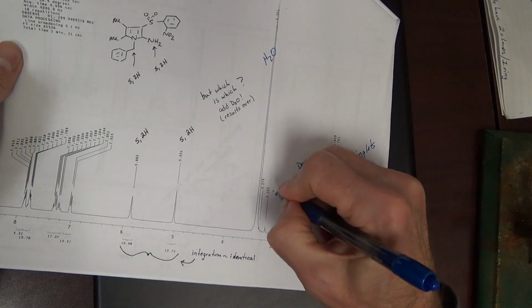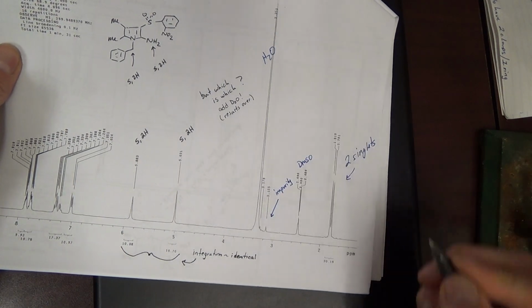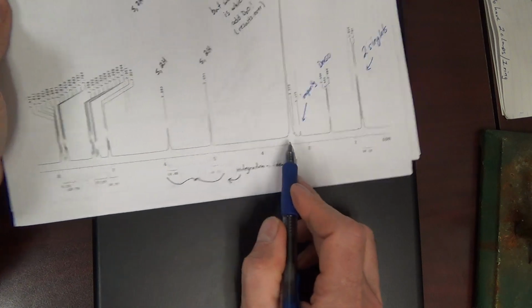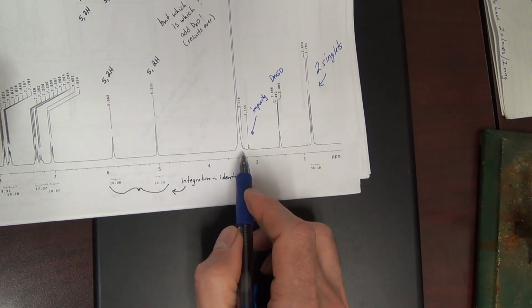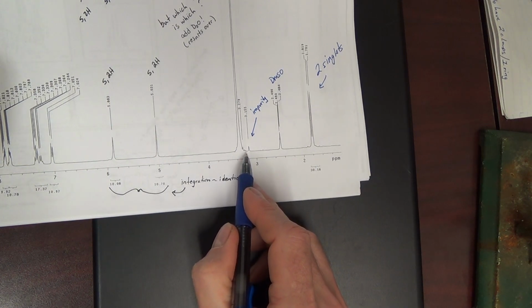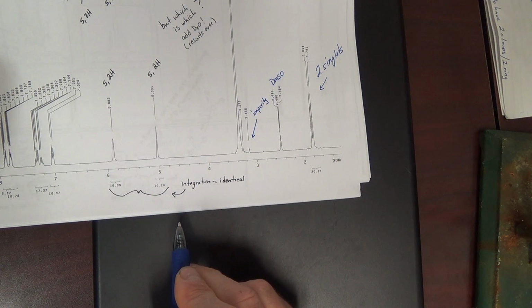This is actually a little impurity, because otherwise the baseline should be flat. And this is an example of how NMR is very good at showing impurities or showing purity of your compound. All right.